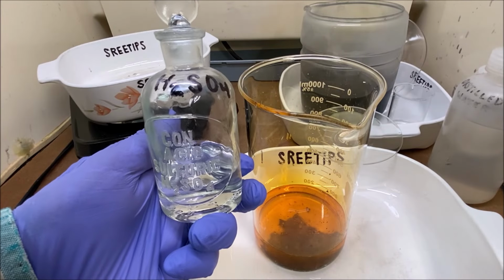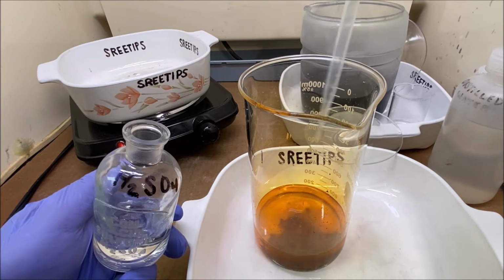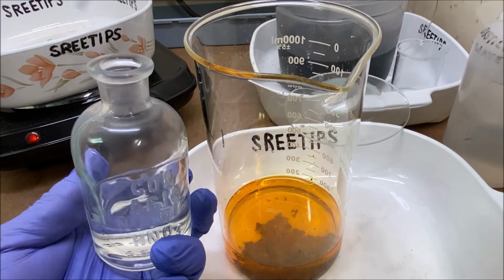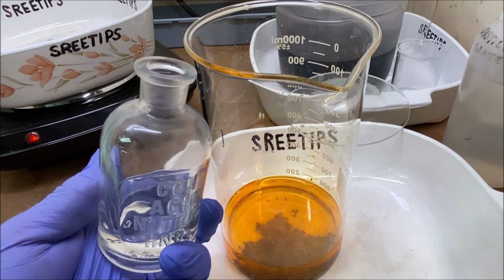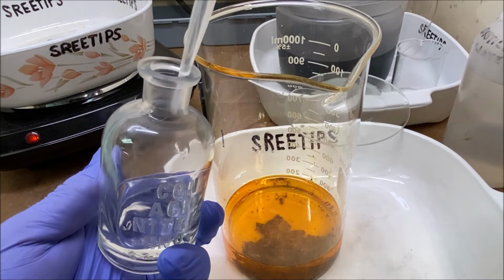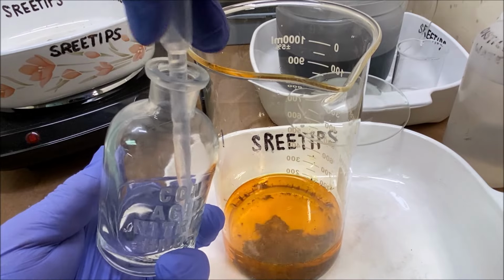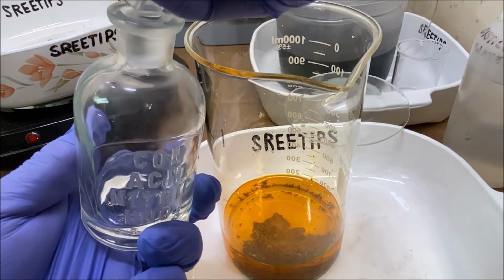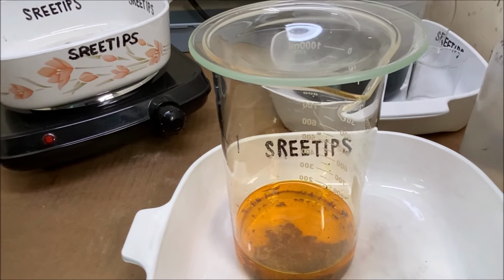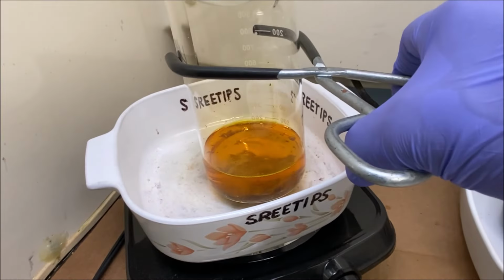Now we'll add some sulfuric acid to precipitate out any lead that may be present. I think for this much gold, expecting 27 grams, let's go with 5 3-milliliter doses of nitric acid. And now what we'll do is set this up on the heat and begin dissolving the gold in aqua regia.